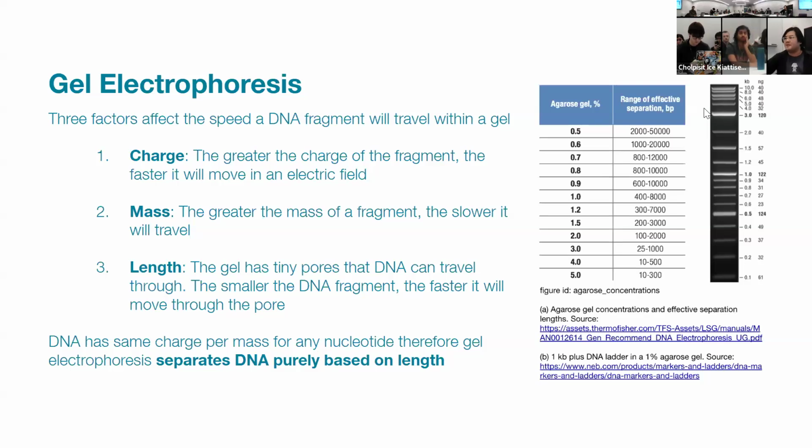If you want to draw something using this DNA pattern, you may want to consider if you want the bands to be brighter. You may want to duplicate that kind of cut size, because if the DNA gets smaller, then the weight or the mass of DNA gets smaller as well. So that's why when you do the DNA cutting, you take the same DNA and you cut it into two pieces. The one that's bigger usually is brighter because it has more mass, right?